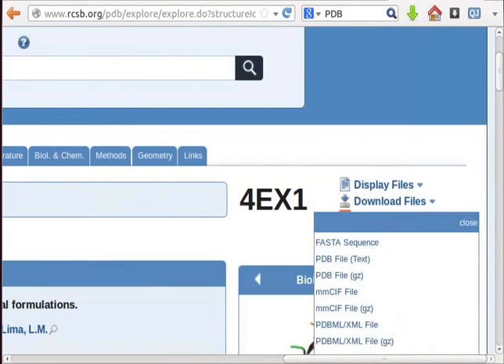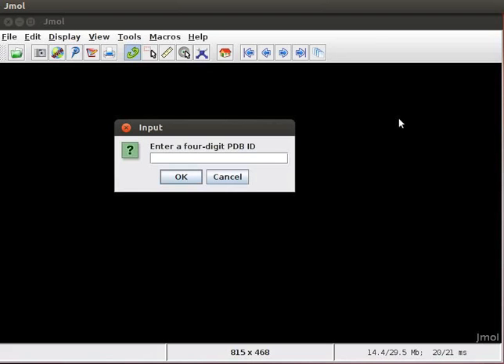Similarly, you can download the required .pdb files of various proteins and save them in separate files. Now, let us switch to jmol window to view the 3D structure of insulin.